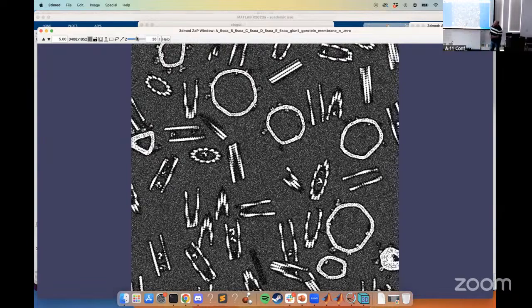That is all done in Chimera when you define where the transmembrane domain is. If you want to do transmembrane, I would suggest the OPM database. It's basically our RCSB for membrane proteins. Those files automatically work, those guys annotate their files very well. If you have your own custom thing, you fiddle around with Chimera.